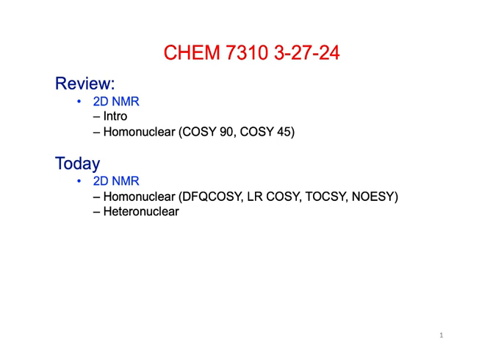And we essentially acquire a series of one-dimensional FIDs, spectra, and then we do a second Fourier transform in the opposite direction. So it gives us our 2 dimensions, 2 frequency dimensions.